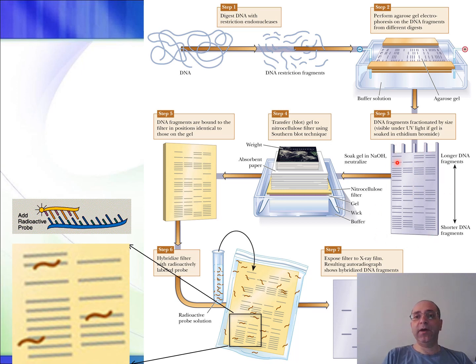These are the wells. And here we have sample 1, sample 2, sample 3, sample 4. Each sample has DNA fragments of different sizes or different lengths. Since we're starting from here, here we have the large DNA fragments, and here we have the small DNA fragments. So these are the largest DNA fragments, and these are the smallest DNA fragments, and here we have everything in between. Then the DNA is placed on top of a membrane, or actually underneath, but it doesn't matter.